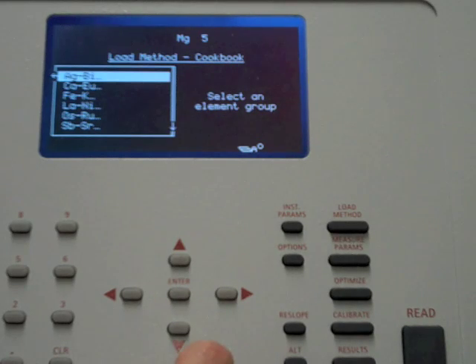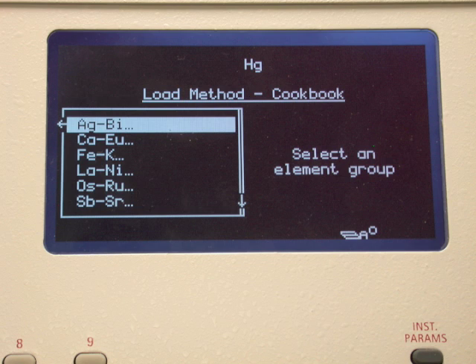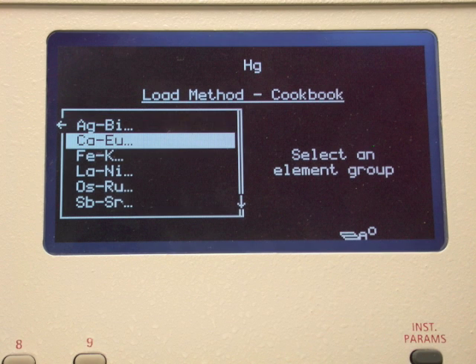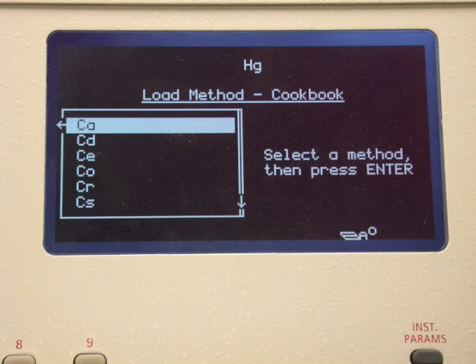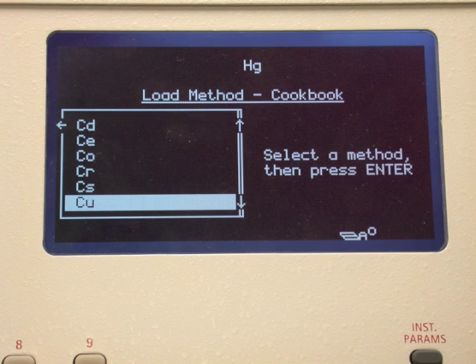Elements for analysis are alphabetized using their atomic symbols. In this demonstration we are going to set up to do a copper analysis. Use the arrow key to highlight the calcium to europium section. Copper is listed just beyond the bottom of the window. Scroll down using the arrow key until the element is highlighted, then press enter.